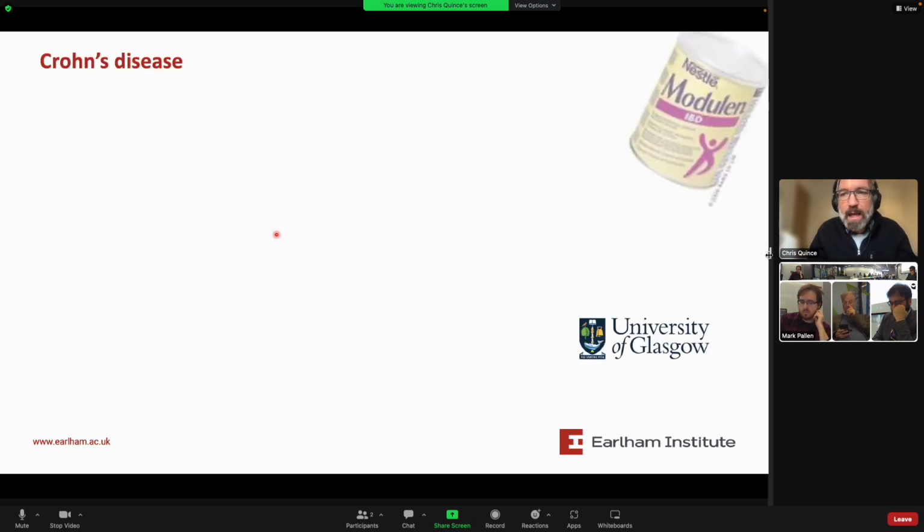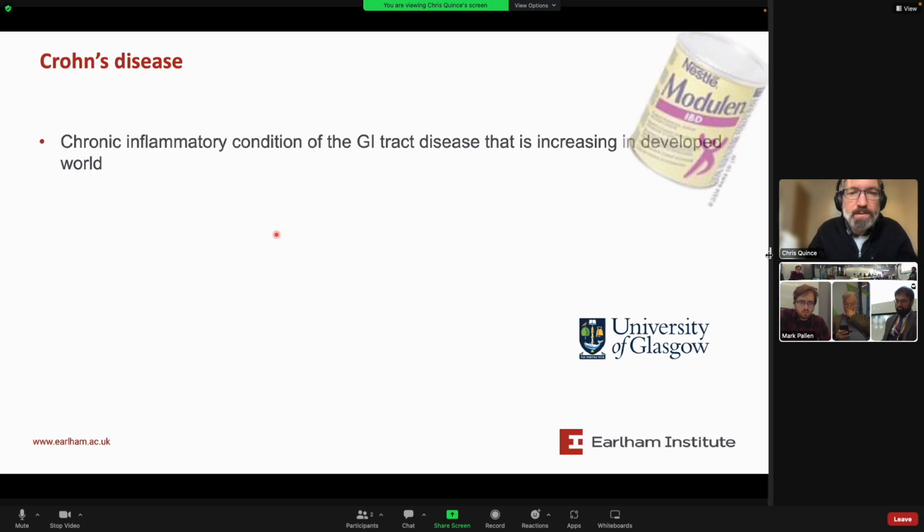Okay. And now I've just got a couple of slides showing you the results of a 16S analysis to give you a little bit more context of what you can do with this type of sequencing. So this is a study of something called Crohn's disease that I've been involved with for a long time, actually. Crohn's disease is a form of IBD, inflammatory bowel disease.